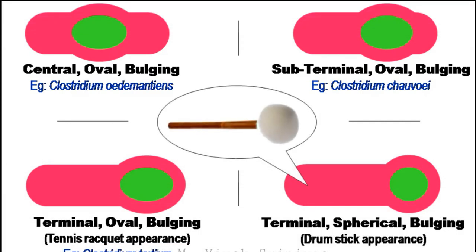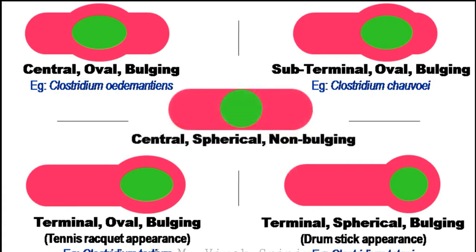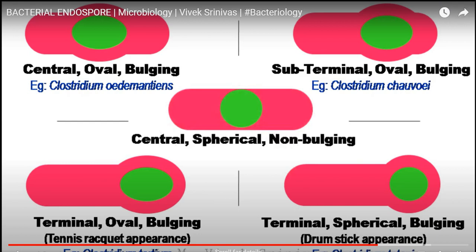Once the bacteria are treated with 5% aqueous malachite green staining solution, which is the primary stain used here, along with the heat treatment, it gives green color to both the bacteria, but only the spore portion of the spore-forming bacteria fixes the primary stain.